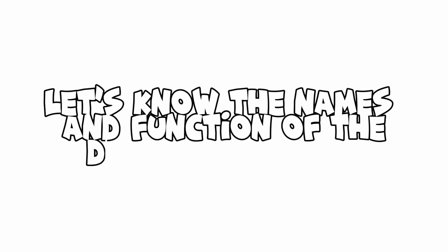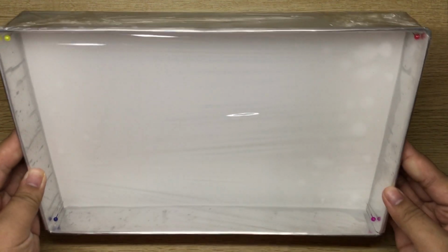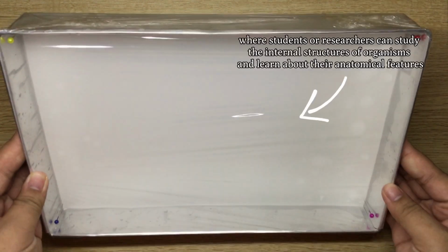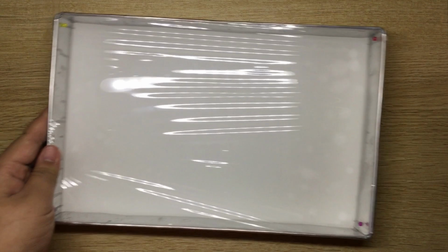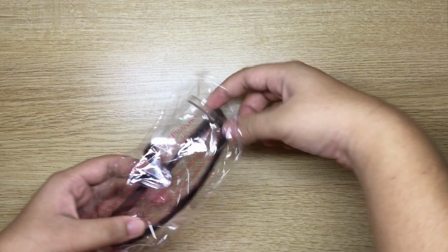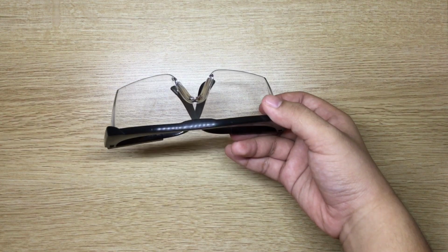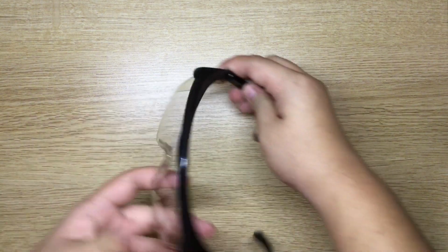Let's now learn the names and functions of the dissecting tools. We have the dissecting pan, where students or researchers can study the internal structure of organisms and learn about their anatomical features. Then, we have goggles, which are used to protect the eyes from splashes of preservative and specimen fragments.